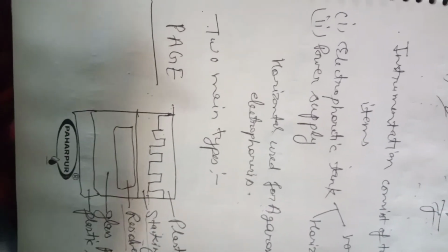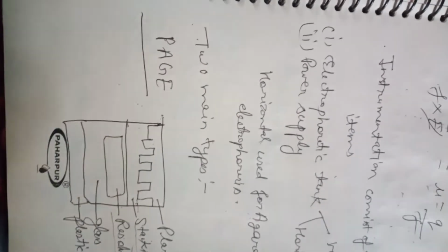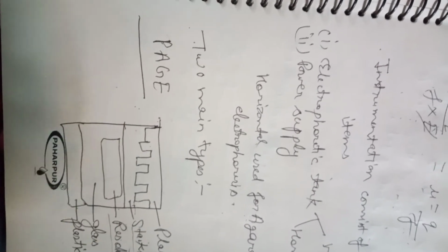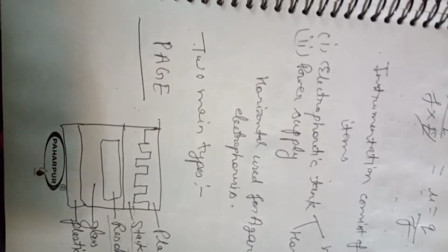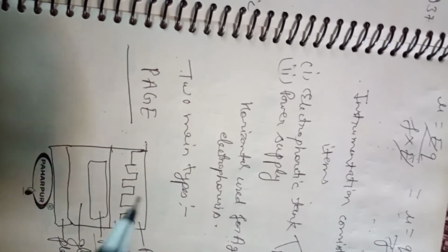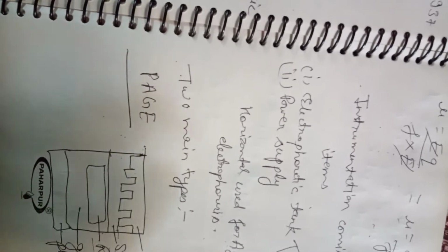During electrophoresis, when the tracking dye reaches the bottom of the gel, the current is switched off, the gel is removed, and it is stained with a protein staining dye, Coomassie brilliant blue, for a few hours. The gel is then washed with a de-staining solution containing glacial acetic acid and methanol in water. After de-staining, the polyacrylamide gel appears transparent and the protein bands appear dark blue in color.